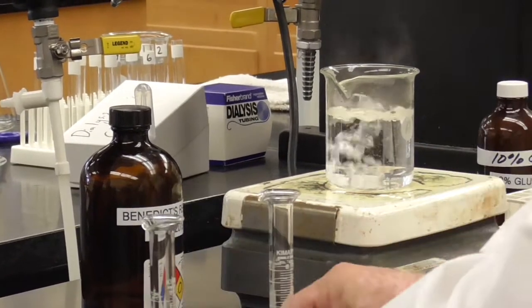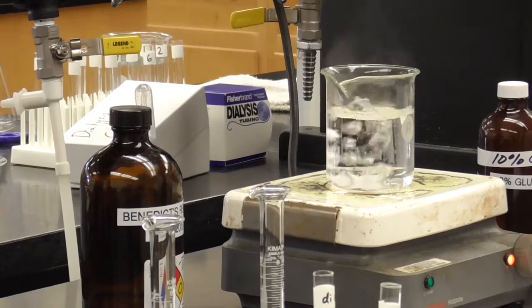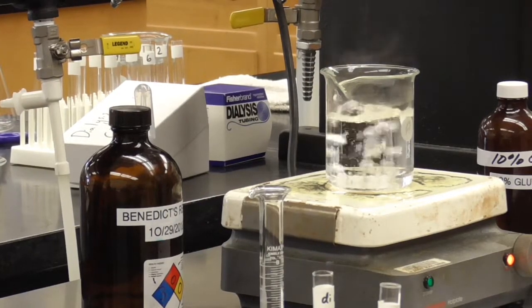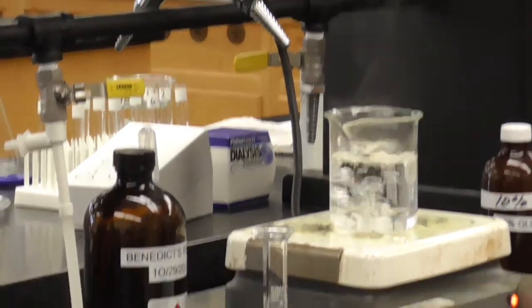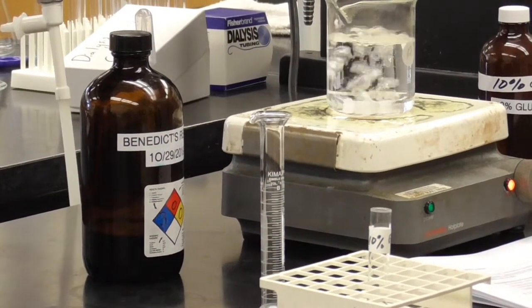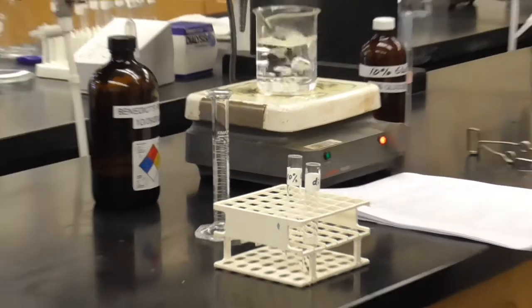We get our negative and our positive just like before. I'll bring our test tube rack over here. The negative will be DI water, and here I've got some in a wash bottle, so I'll just do it this way. 3 milliliters, roughly. A little more, but it'll be okay for this test. Okay, so there's our negative. There's no glucose in there, that's just pure DI water.